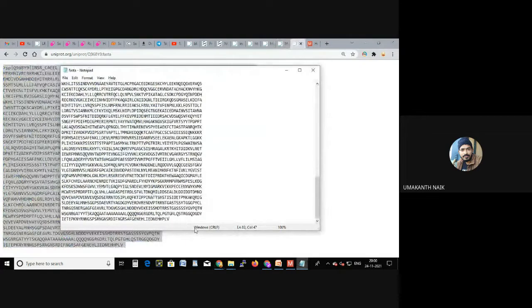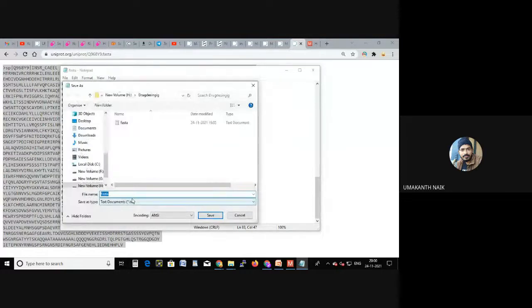Is it clear till here for all of you? Yes, sir. Fine. Then go for File. Don't save it, choose Save As. Name it as mega. I'm just naming it mega to avoid the confusion.